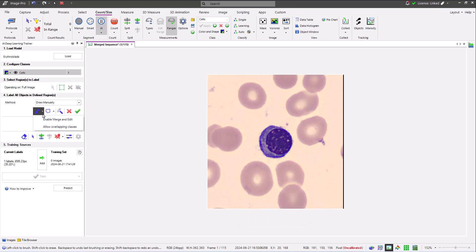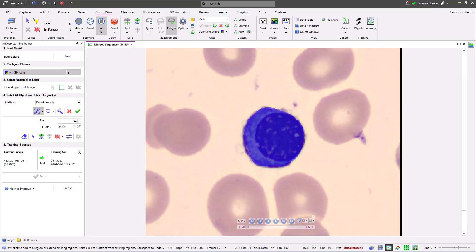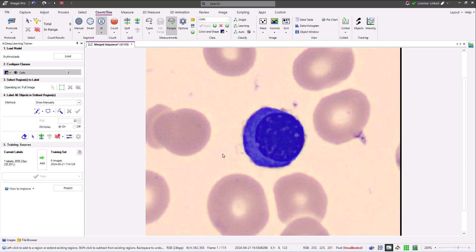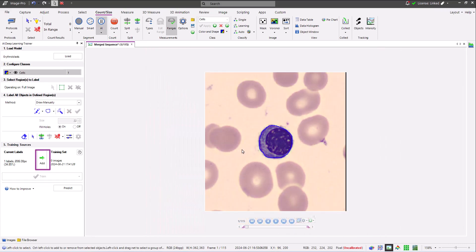After enabling merge and edit, I can make adjustments to the shape I've added and then revalidate. As I'm happy with my training data, I can click the add button to add this data to my training data set.